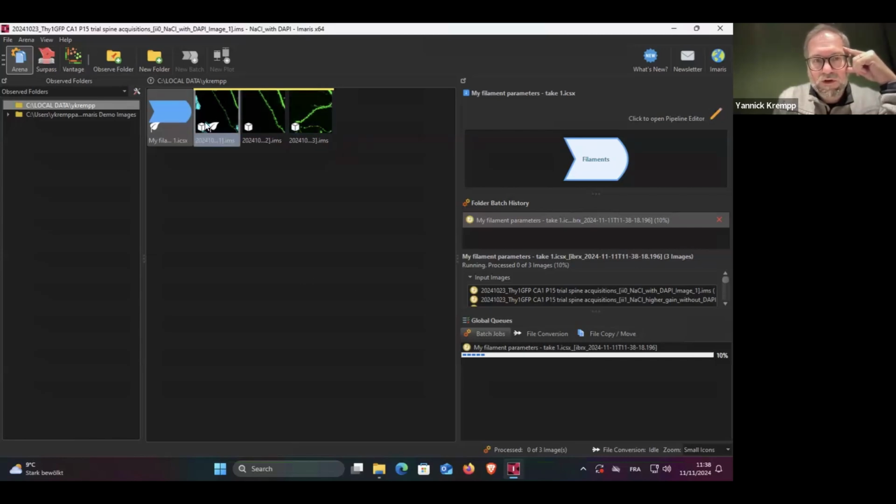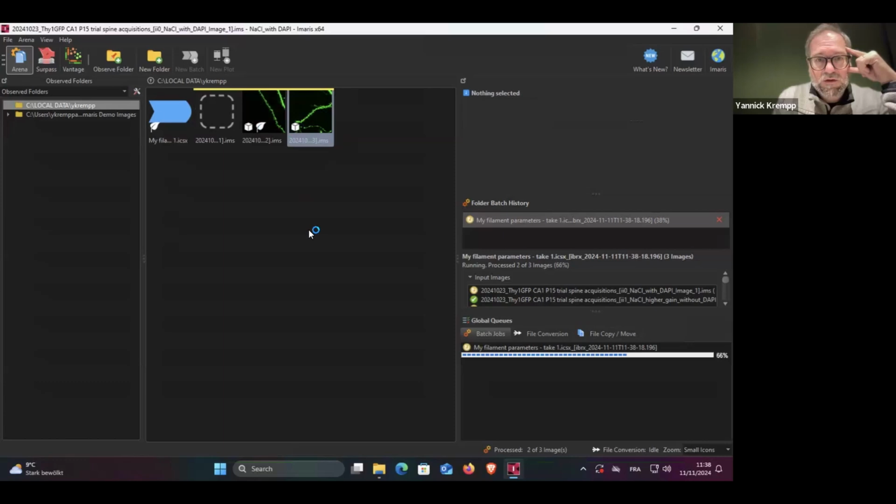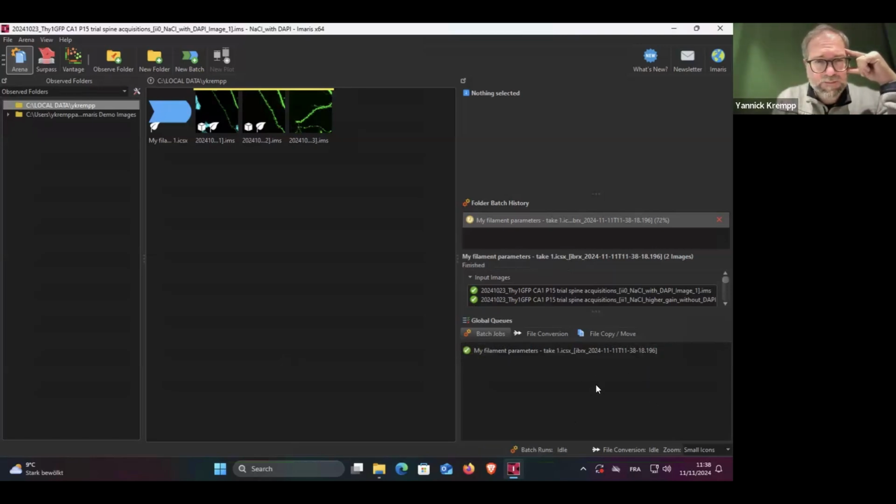So obviously on this image, we will have 2 filaments probably. And on the others, here we have this one now that has been updated, and hopefully the last one as well. Just wait until it's finished.